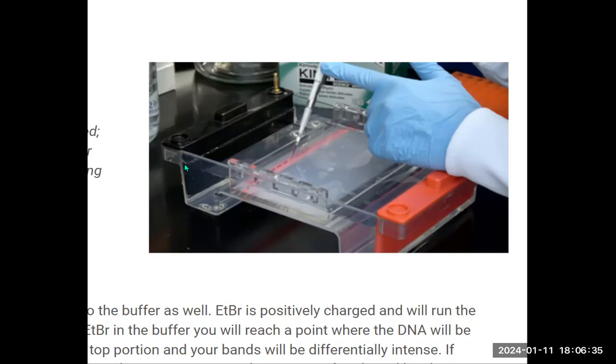We also have the electrodes. The black part is the cathodal part, and the other is the anodal, or the reverse. This one is showing how to load the sample in the wells of our gels. So what comes first? We need to place our gel slab, and then we will place the buffer. There's an indicator here, a line that tells us at what level we should add the buffer.